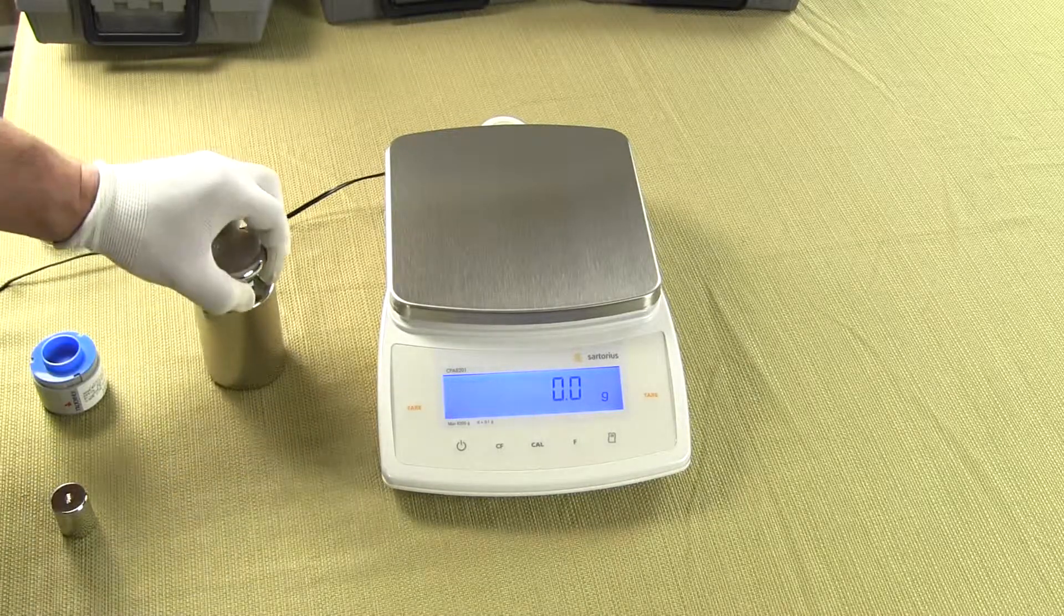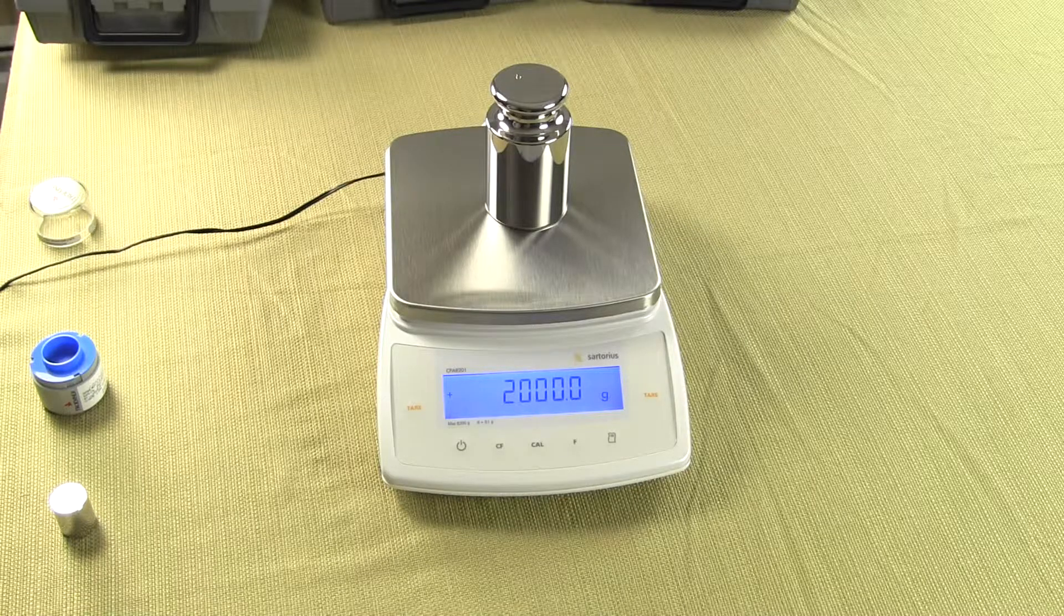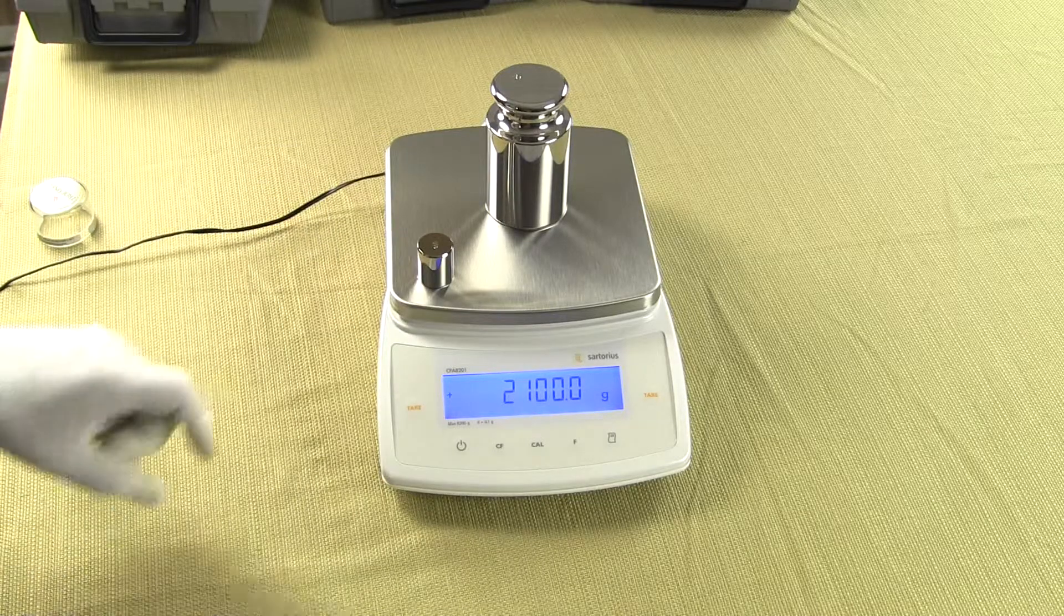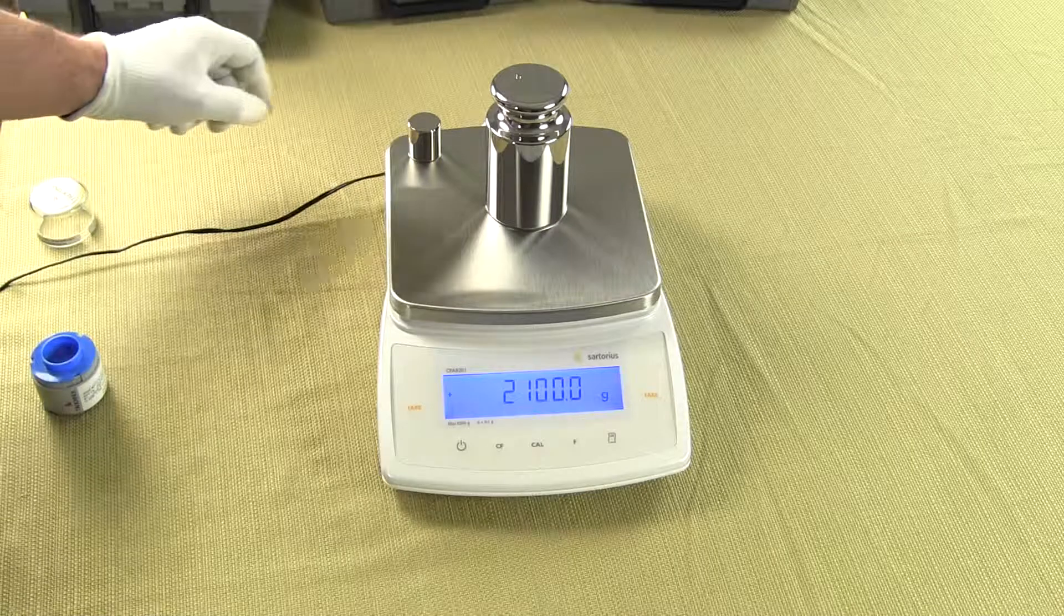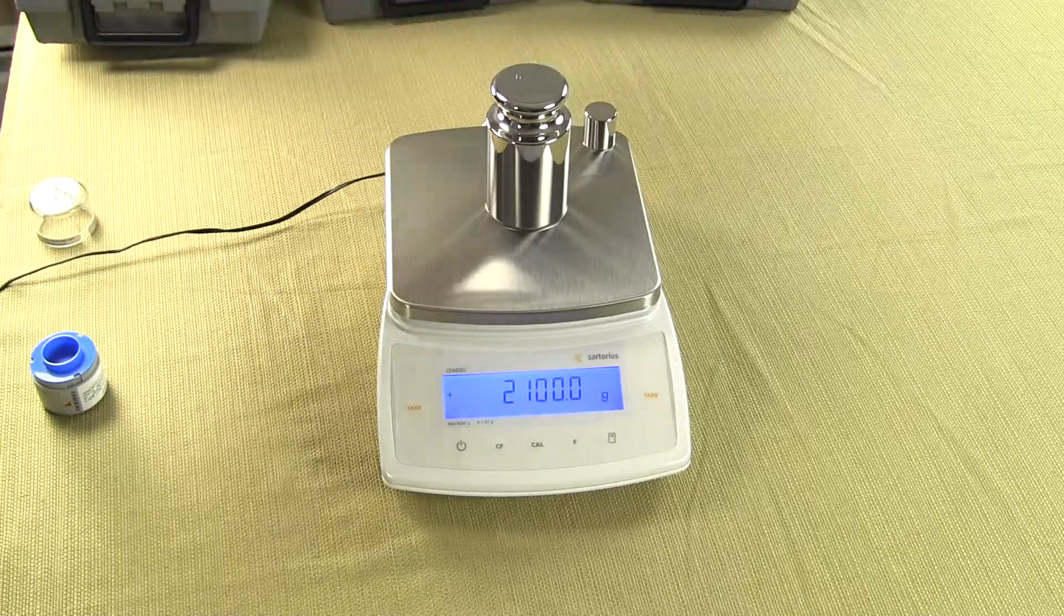Sartorius is top of the line. That's why they hold the Guinness book world record for the most accurate balance in the world and they have been building balances for over 140 years. So you can see when I put the weight in each corner how quick the balance responds and there's no drift.